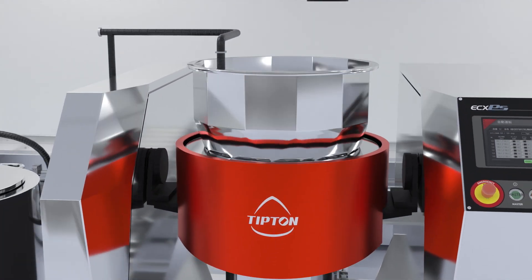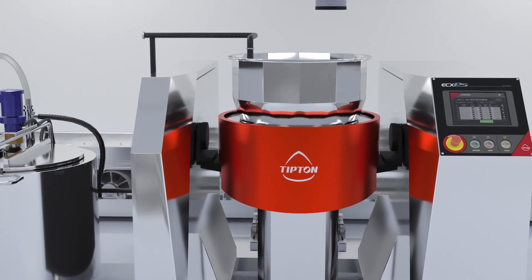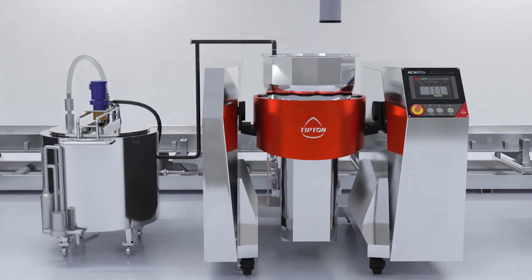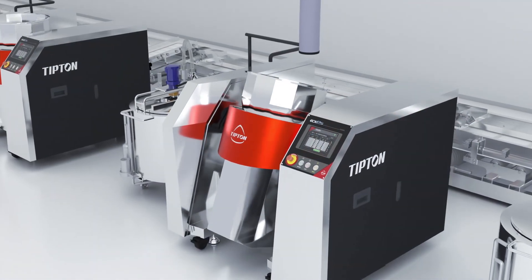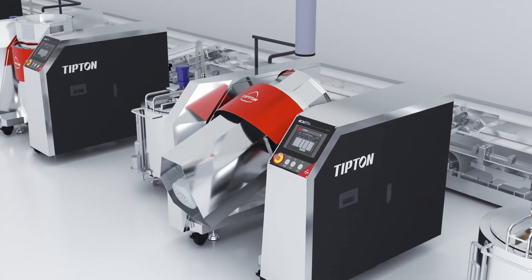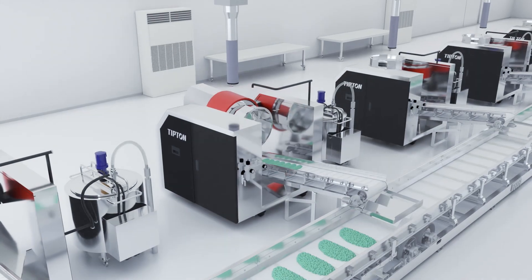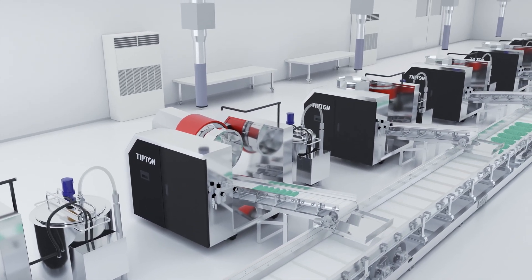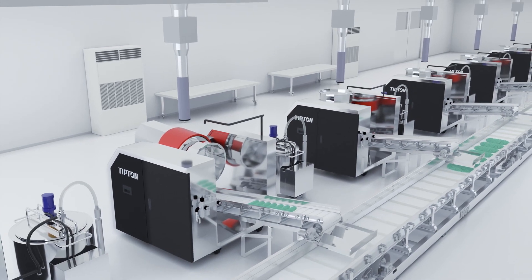Capable of stable production and easy handling, ECX is ideal for automation. By programming the device with rotation speed, processing time, and input amount, and integrating it with a conveyor, it is possible to design a high-functioning processing line that is automated from input to output.